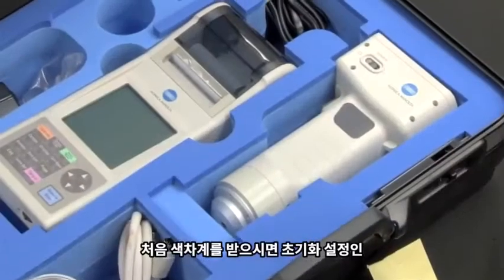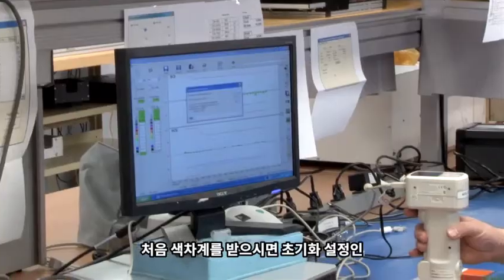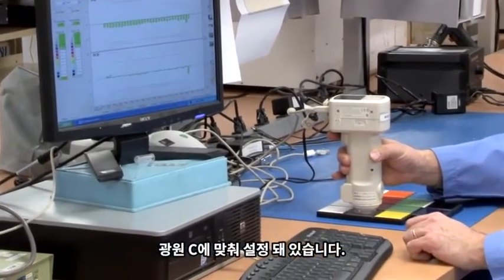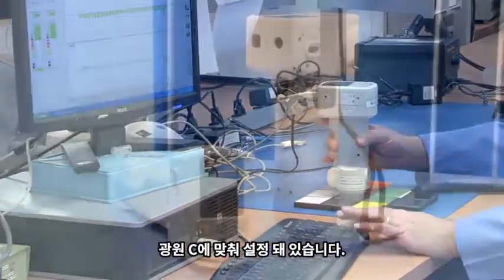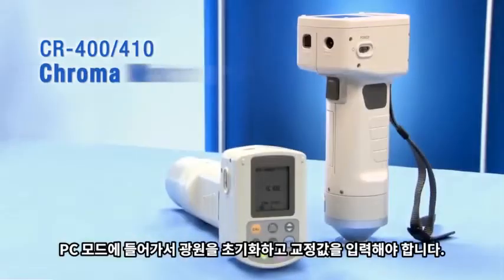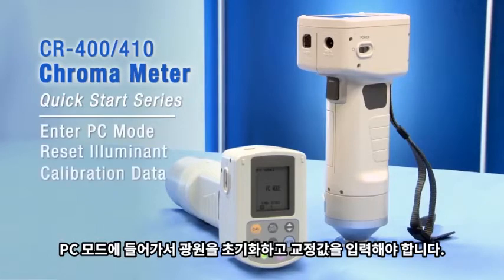When you receive your new chromometer or send it to Konica Minolta Sensing's service department in Ramsey, New Jersey, your instrument will be configured to the C illuminant, which is a factory setting. This quick start series will show you how to reset the illuminant. You will go into PC mode on the CR400 or 410, reset the illuminant, and enter calibration data.